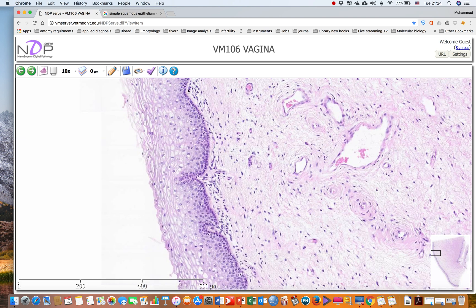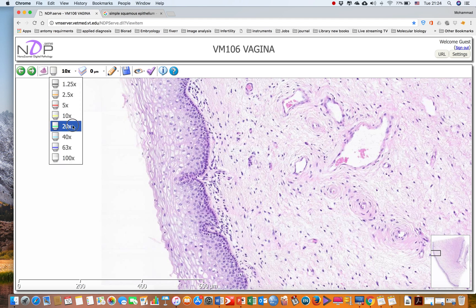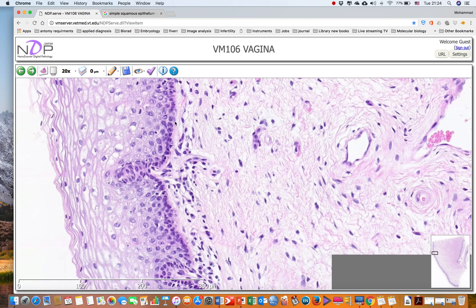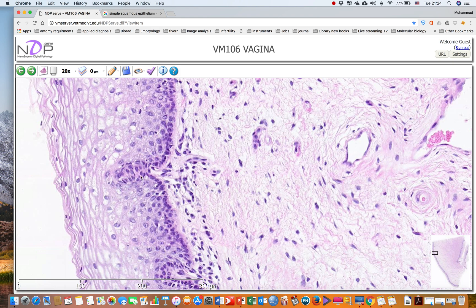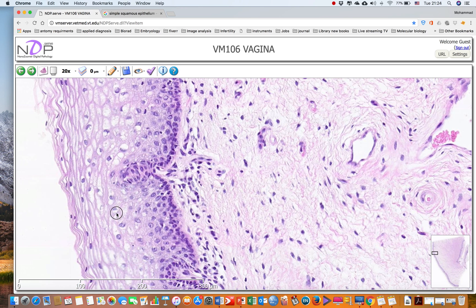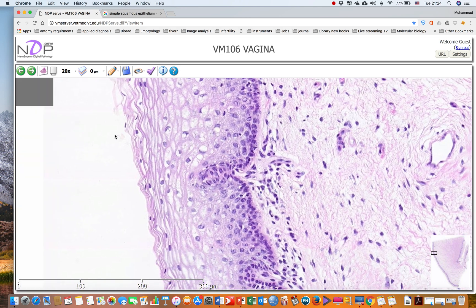At this area, we have the stratum basale, stratum spinosum, and the stratum granulosum. If we increase the magnification again, we can see the stratum basale showing simple cuboidal to columnar epithelium. Then we have the stratum spinosum, and finally, when the cells start to be more flattened, the area of the stratum granulosum.